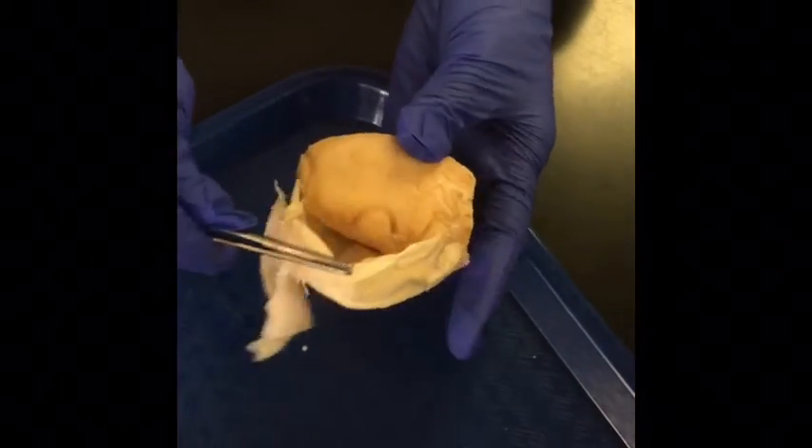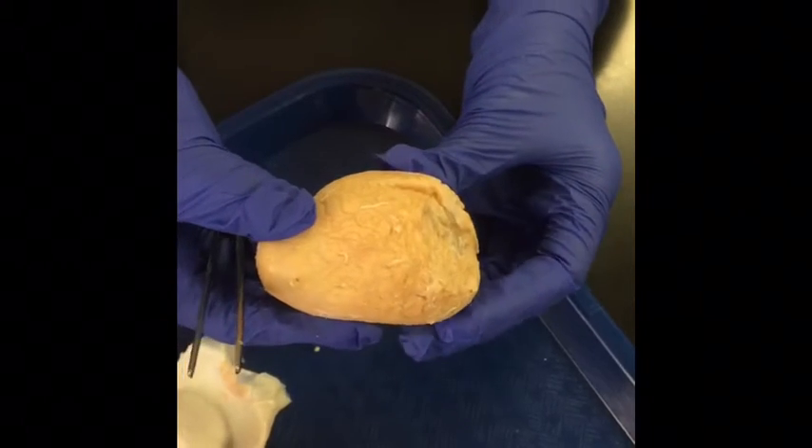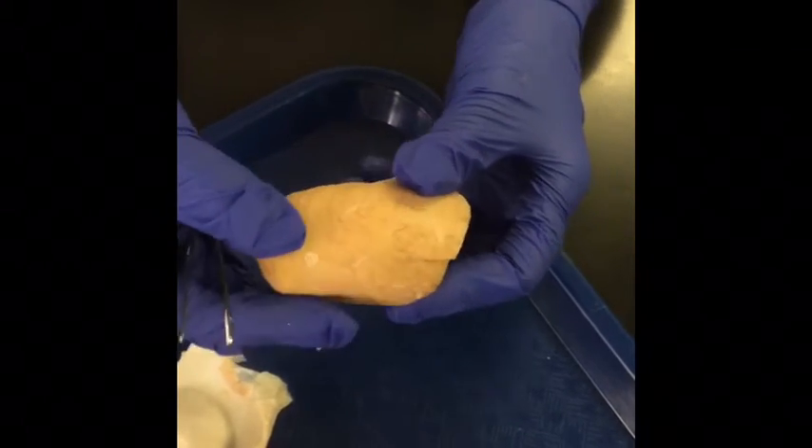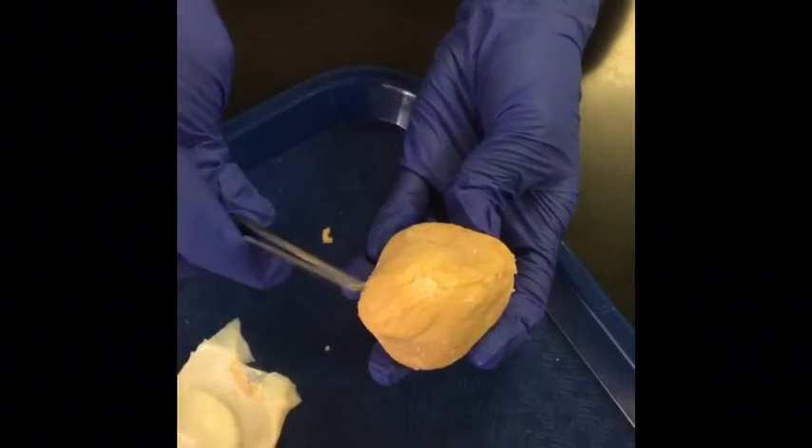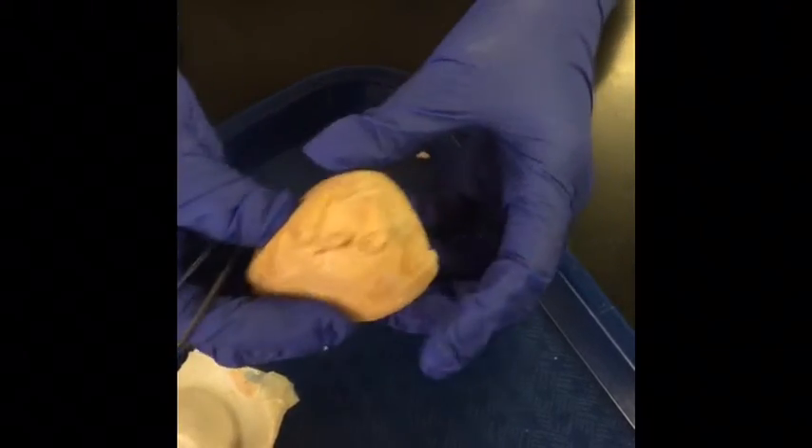So once you skin it off, this yellow thing is called the testes. The fancy word for it is tunica albuginea, and it's just a thick connective tissue capsule. Again, here's the tail and the head.